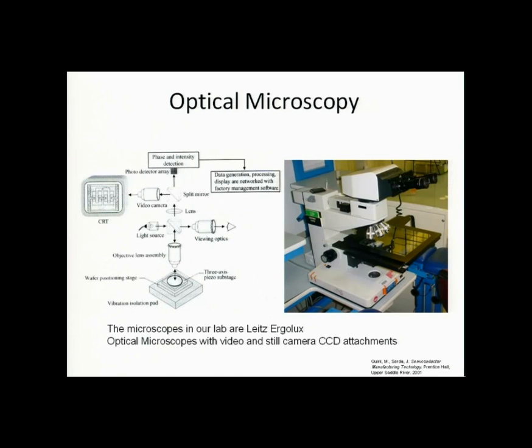Here's a kind of more complicated diagram on the left, and then a picture of a typical optical microscope on the right. This microscope is in our lab. It's a Leitz Ergolux, and the optical microscope has video and still camera CCD attachments.